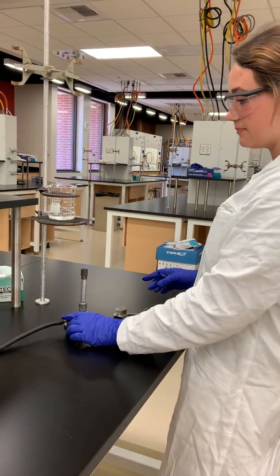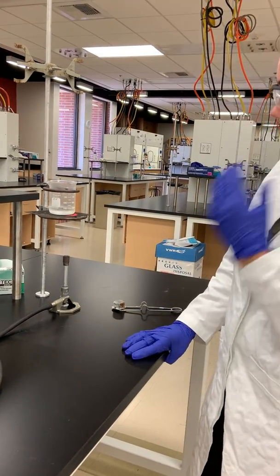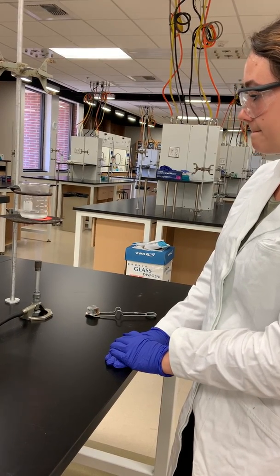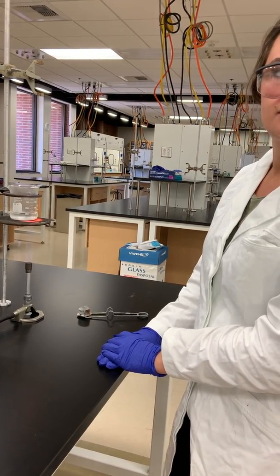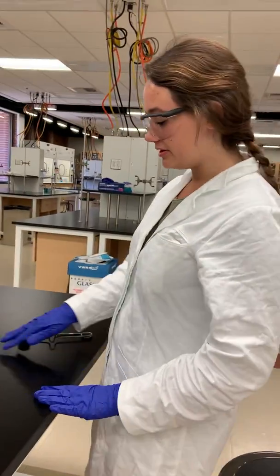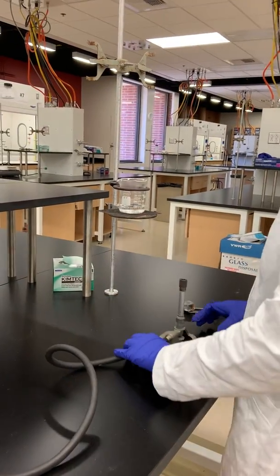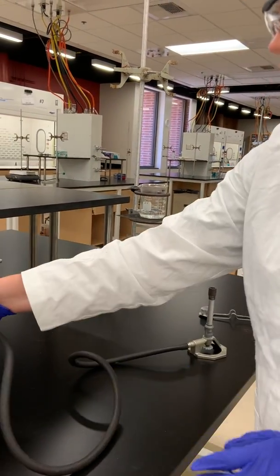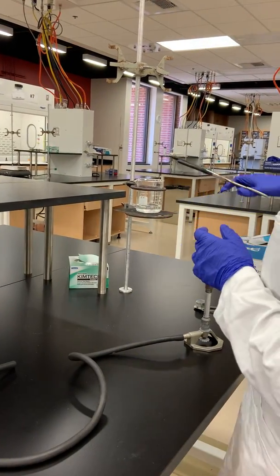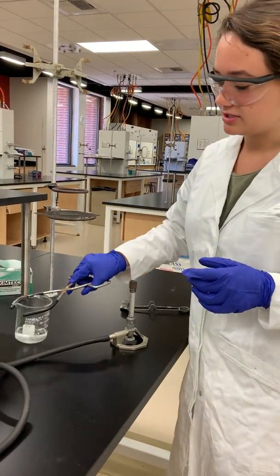Then I'm going to place this underneath and wait for the water to heat up. Once the water gets appropriately heated, I'm going to turn off the gas, remove the Bunsen burner, and then remove this from here. And then I'm going to take the rubber tongs to grab this safely so that my hands don't get burned and place this on the top.